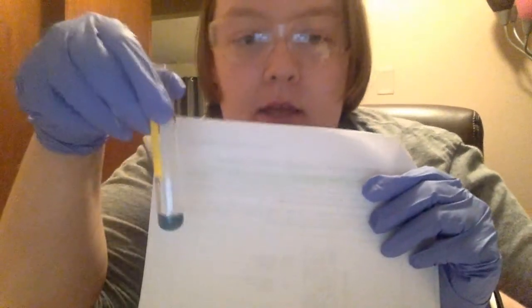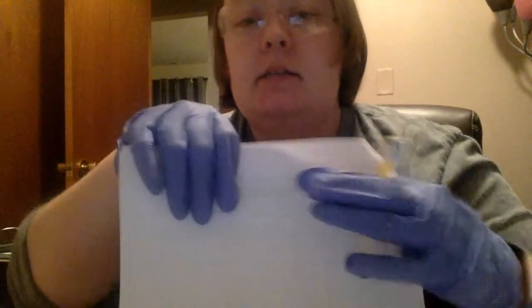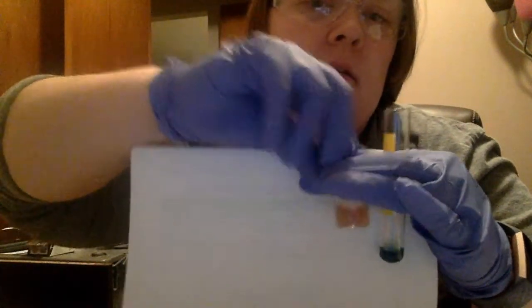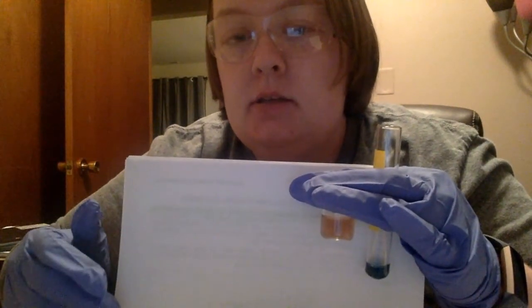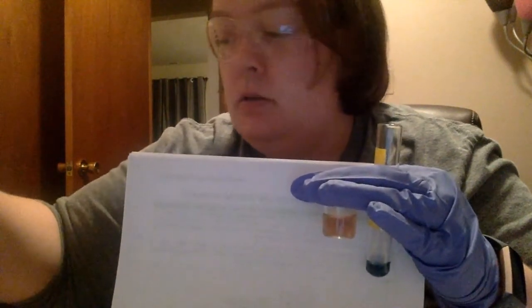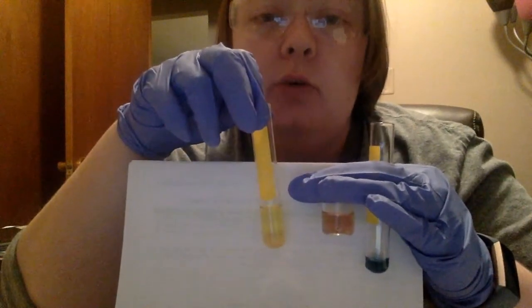The first one that came out was a blue component. Because this one came out first, it is the largest. So here is our blue. The second one that I collected was a pink color. Because this came out second, it is the middle as far as molecular size. And the third that I collected was a yellow color.